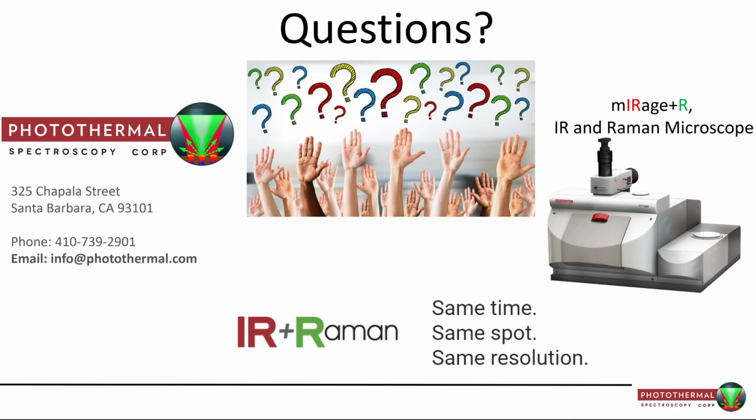Can you use different probe lasers, and how will the results change? So I'll take that one. Our standard probe laser is a 532. Of course, that measures the infrared. It is also the Raman excitation laser, and that's a good general laser because it's quite strong, especially for the Raman, and it also provides good spatial resolution. We do have the option for a 785 probe beam.